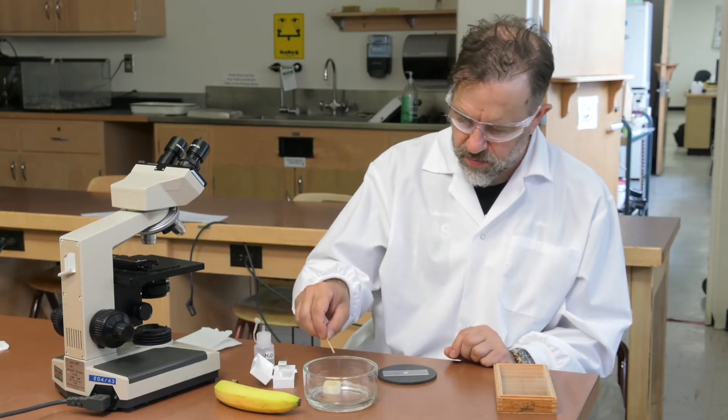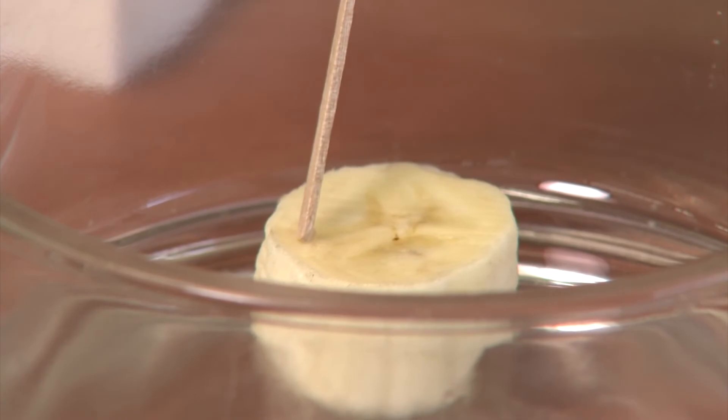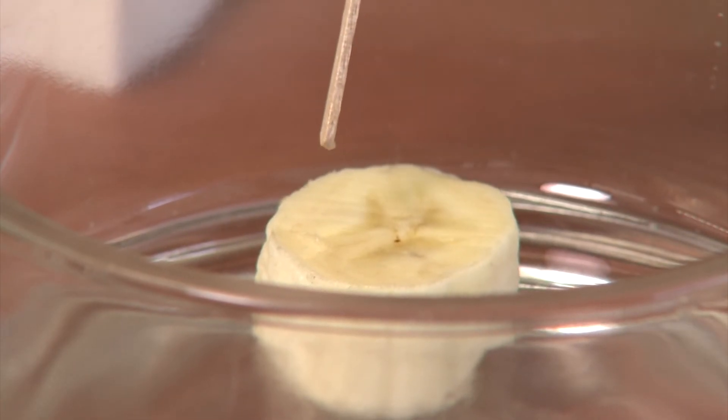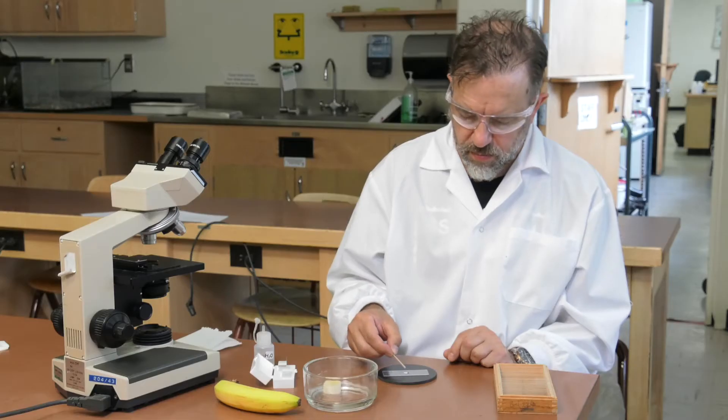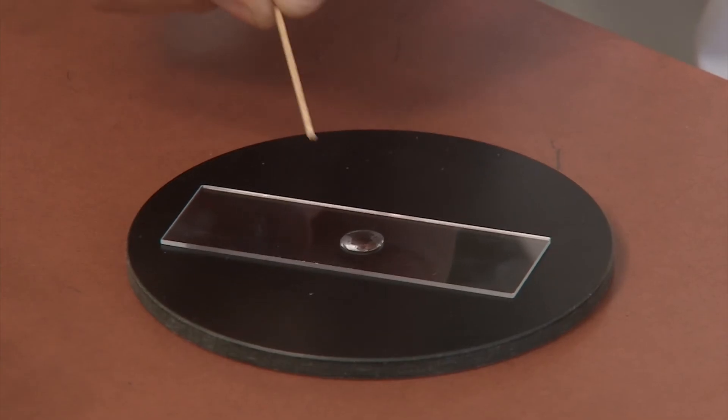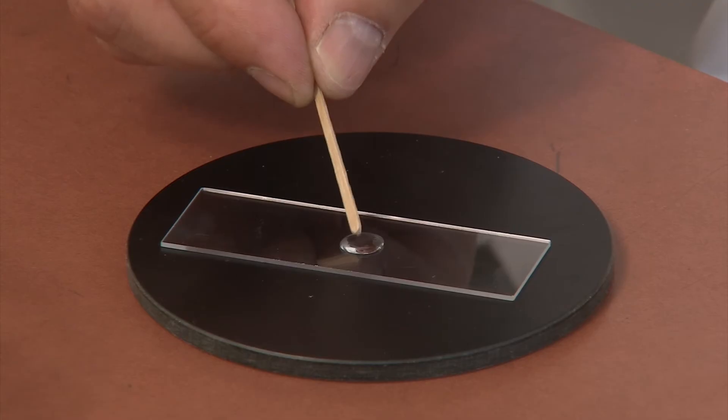Take a toothpick and gently touch the blunt end to the piece of banana fruit. You don't want to dig into the fruit or pick up a clump of tissue. Stir the end of the toothpick in the drop of water.